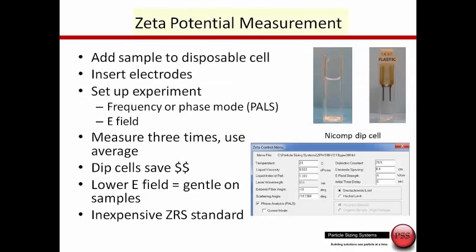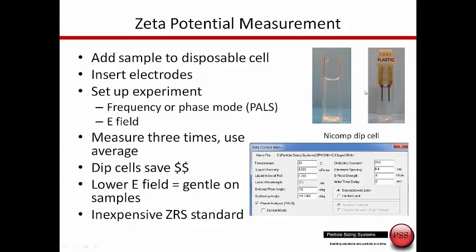The system can also be configured to measure zeta potential, which is a measure of the charge on the surface of particles. This is an easy measurement to make. We take a plastic disposable cell, fill three quarters with the sample, insert our dip cell, and these electrodes are going to apply the electric field and we take the measurement.